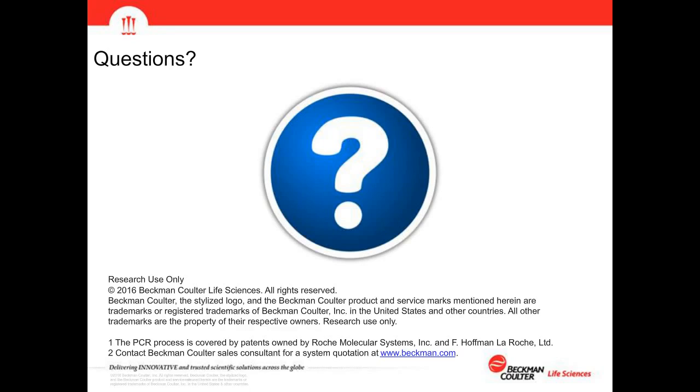These data need to be very robust. They need to be handled with statistical approaches for data analysis, et cetera. All of that only makes sense if you can generate data that you can trust, that are reliable, and laboratory automation is definitely a key tool to enable the generation of such data.